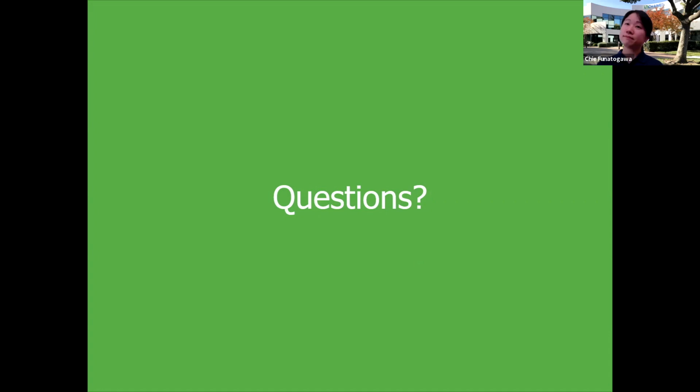Right. Chia, this is a question we get often, so I know you will have the answer. How does a measurement of aggregates on Stunner compare to measurements of aggregates using size exclusion columns? I think this is a common question. That is a very common question. One of the key things we want to emphasize is you don't want to directly compare every piece of data from SEC with DLS.